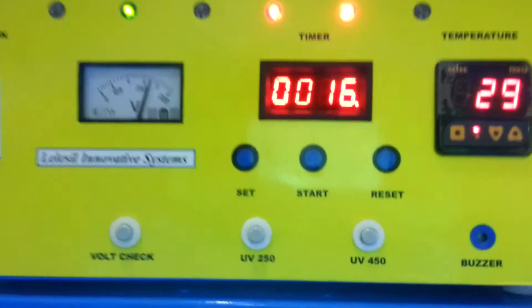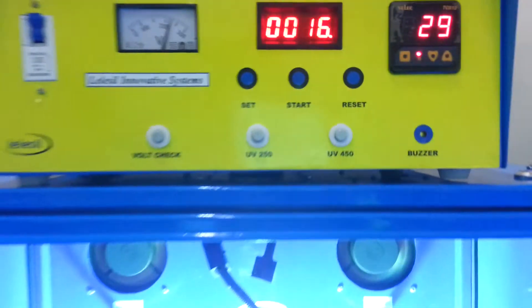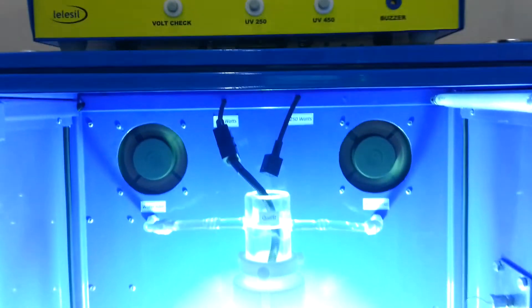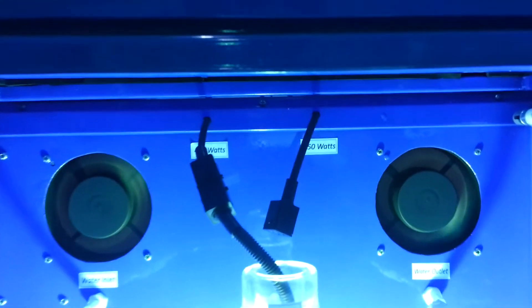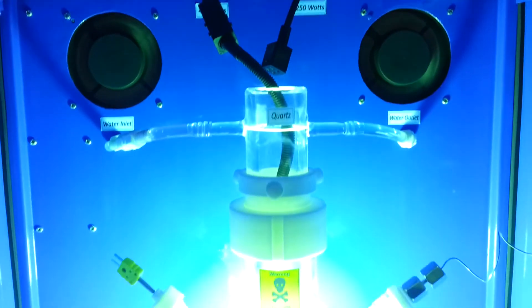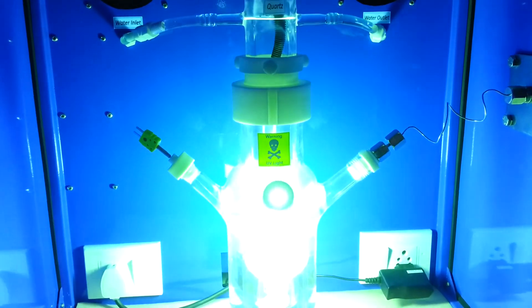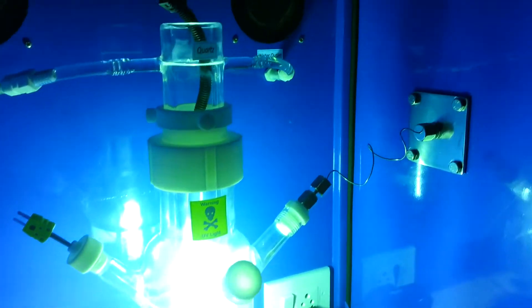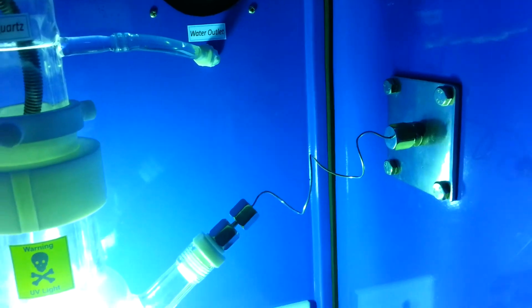Special controller for 250 and 450 watt. Dual exhaust system. Special hydrogen port, dual exhaust system, special hydrogen port.